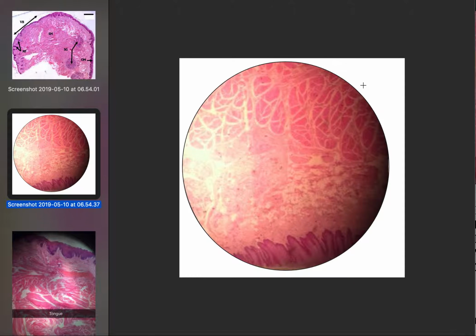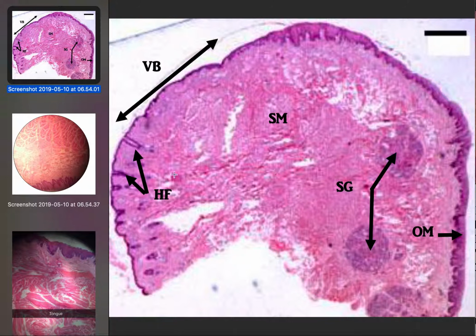Here's another close-up of your lip, and here are those hair follicles we mentioned. Don't confuse these with your fungiform or filiform papillae. That's not the same thing. And by the way, the lip is quite U-shaped, and if you zoom out you'll see that it's U-shaped.